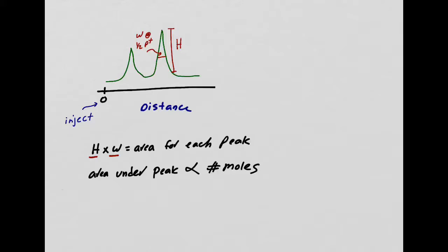And I take the width at half point. And why does the area under the peak matter? The area under the peak matters because it's proportional to the number of moles. And when you have that, then you can figure out the molar composition by comparing relative peak areas. When I compare these 2 together, then I can figure out the molar composition. Again, they're relative to each other.